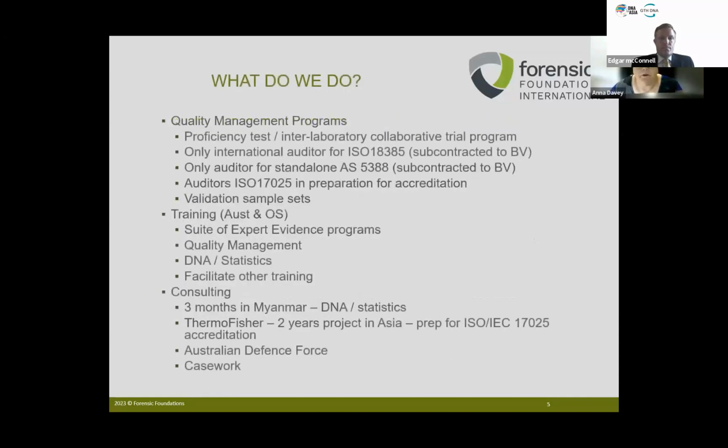So what do we actually do? We run a broad range of programs. Quality management programs are relevant to this presentation. So I've mentioned the proficiency tests and interlab collaborative trials that we run. We are currently the only international auditors for ISO 18385, which is the standard which is required for manufacturers of DNA consumables. So those scientists who are listening to this, who have used kits from a supplier for the DNA profiling, have a look on the box and in the paperwork, and if they are ISO 18385 certified, then Forensic Foundations was responsible for that certification. We're also the only auditors for standalone AS 5388, which is a forensic science standard, which I'll talk about later.